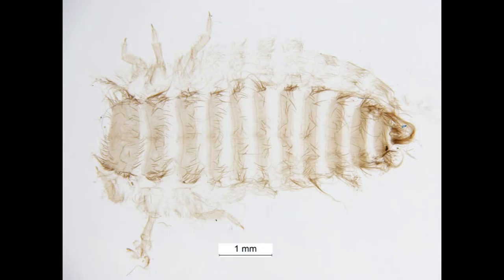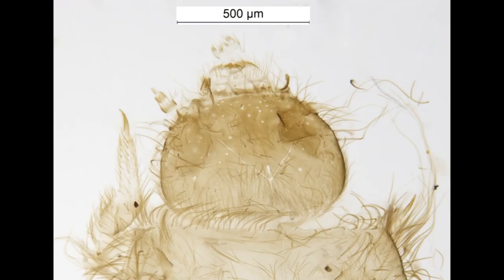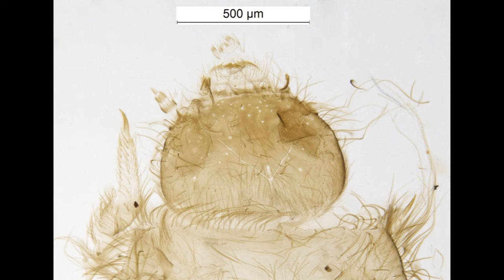The final slide mount should show a well-cleared body with the tergites, legs and seta easily visible. The head capsule, when positioned dorsally, clearly shows the critical features for identification such as the antennae, epipharynx and sensory setae. With this specimen the mandibles have been left intact, and when positioned correctly all the key features are still easily viewable and importantly the head capsule is undamaged.